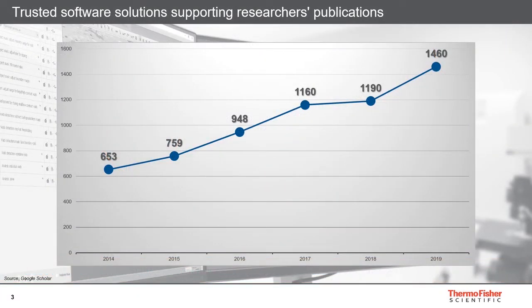Avizo Software is a trusted solution that has been adopted by many researchers around the world. As you can see on this chart, every year, more and more publications use Avizo Software to visualize and analyze their image-based data.